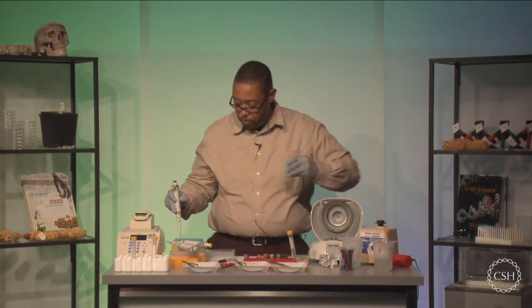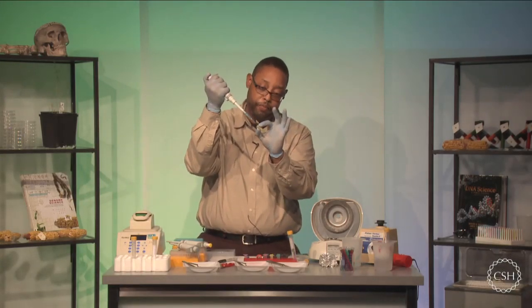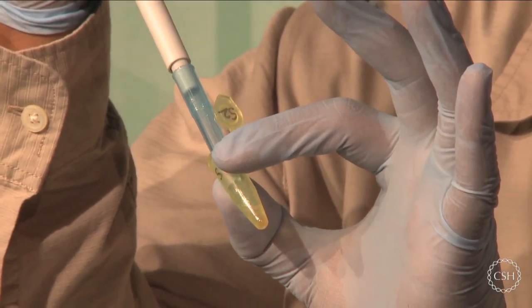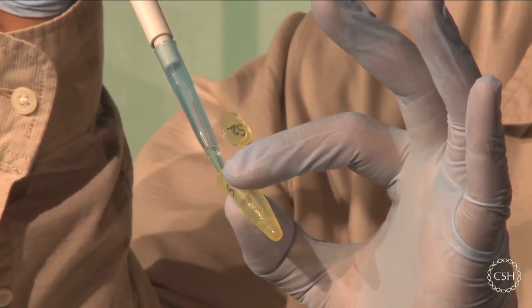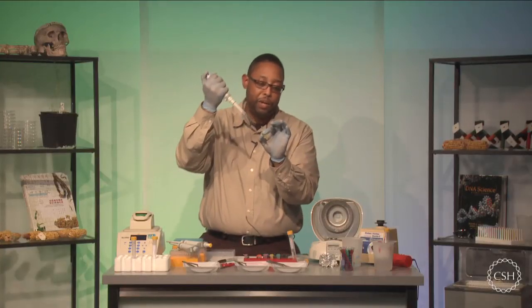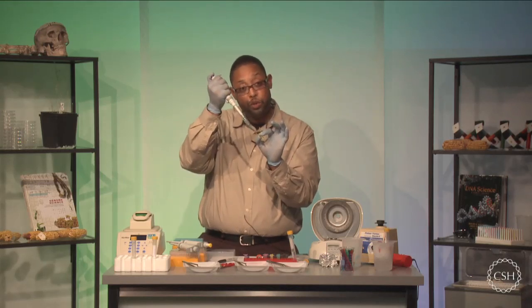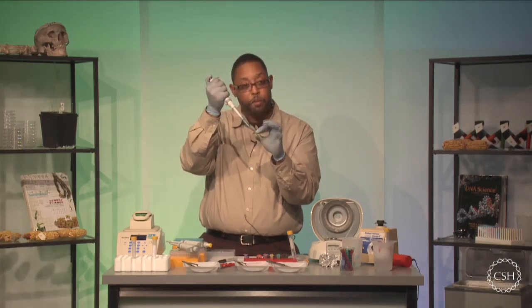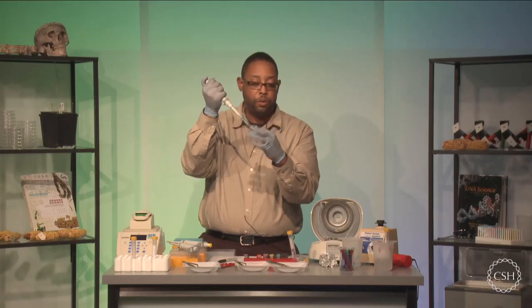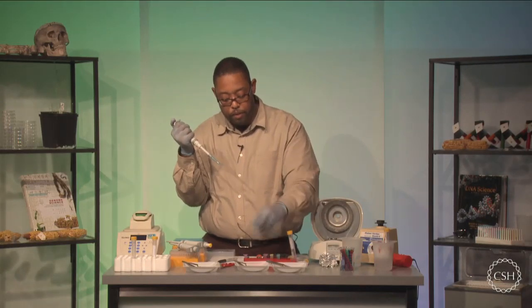I'm going to go to sample number 2 and do the same thing. I'm going to take 150 microliters from this test tube. Now what I noticed from this sample is I have just a little bit of debris at the top of the supernatant. That's okay. Push through the little bit of debris at the top of the supernatant, go into the main clear area, and draw up your sample. It's okay that we have a little bit on the outside. We'll be sure during the transfer that we don't pull that over.